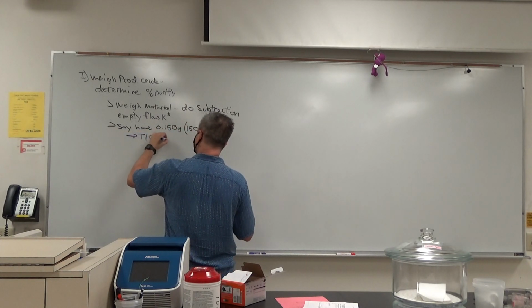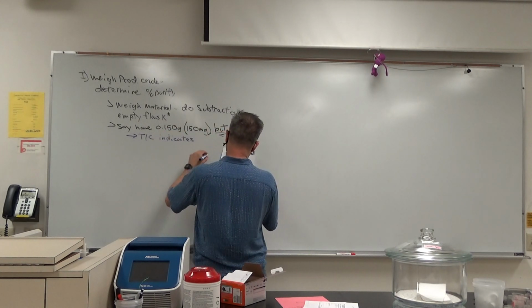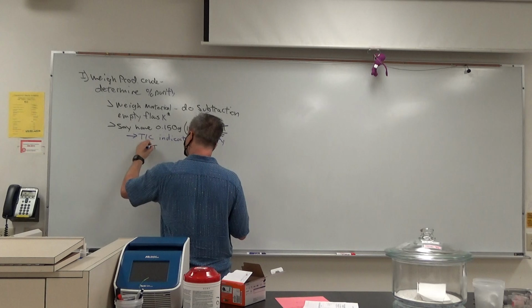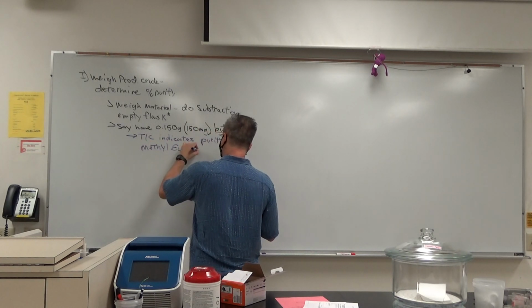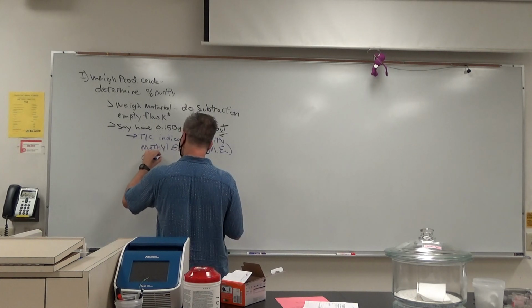Say TLC indicates the purity of methyl eugenol, which we'll abbreviate ME, is 60%.